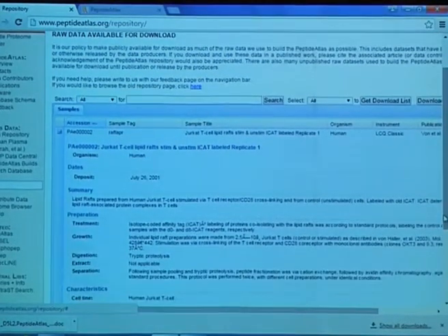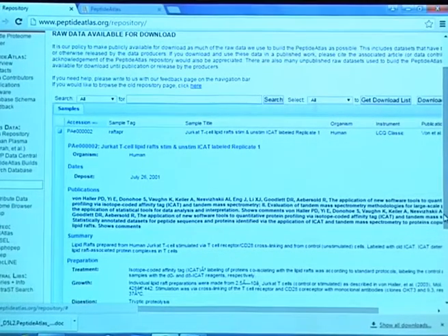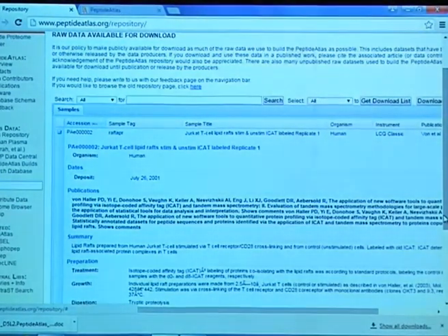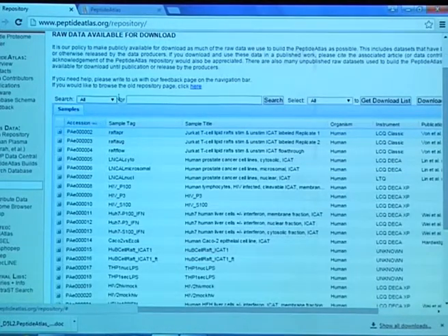So has anyone successfully loaded the page? No? Still loading. Probably after about a minute, it's going to time out and tell you that there's no luck. But the first couple of you that got in may have some success. What this is doing is going and fetching the entire list of experiments each time. So we can actually limit the amount of data that we're asking for.